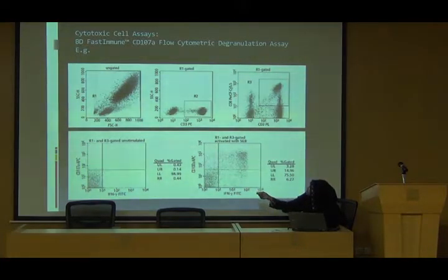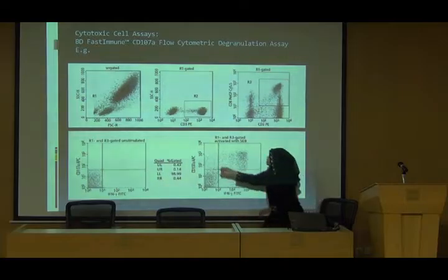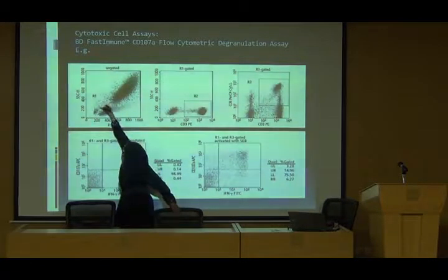So here, this is whole blood. This is the lymphocyte and this is the monocyte region, and this big one here, because it's more complex and bigger, is the granulocyte, which is mainly, in this spot here, the neutrophil, because eosinophil usually goes in the top here. And on the left of the lymphocyte here, because it's highly condensed, it appears more like a dot, it would be the basophil, in this pouch here, somewhere around.